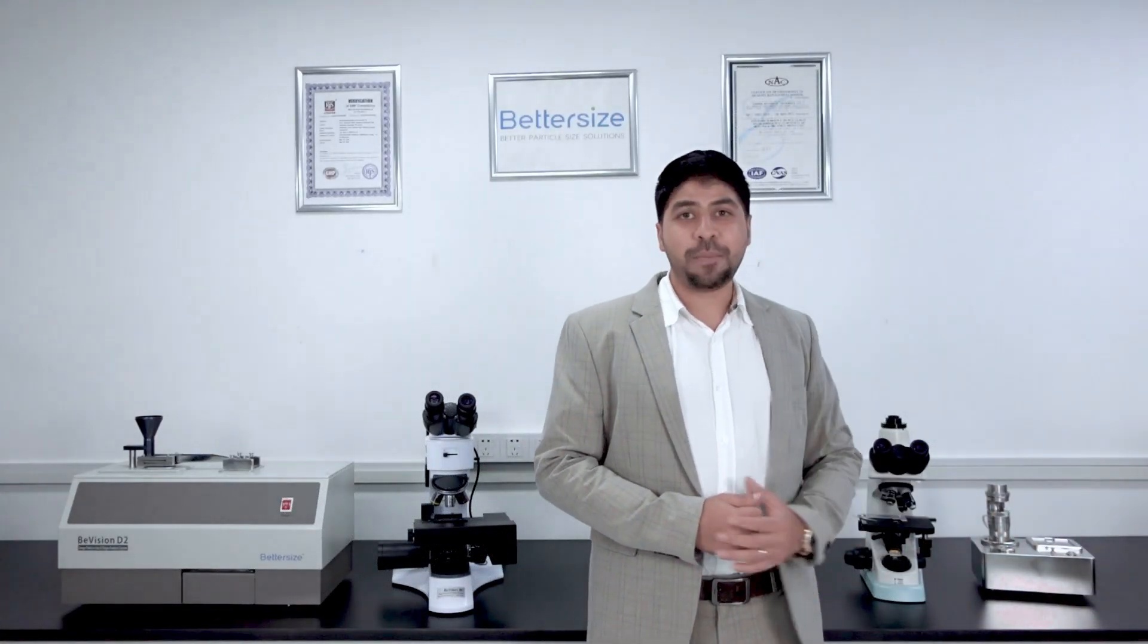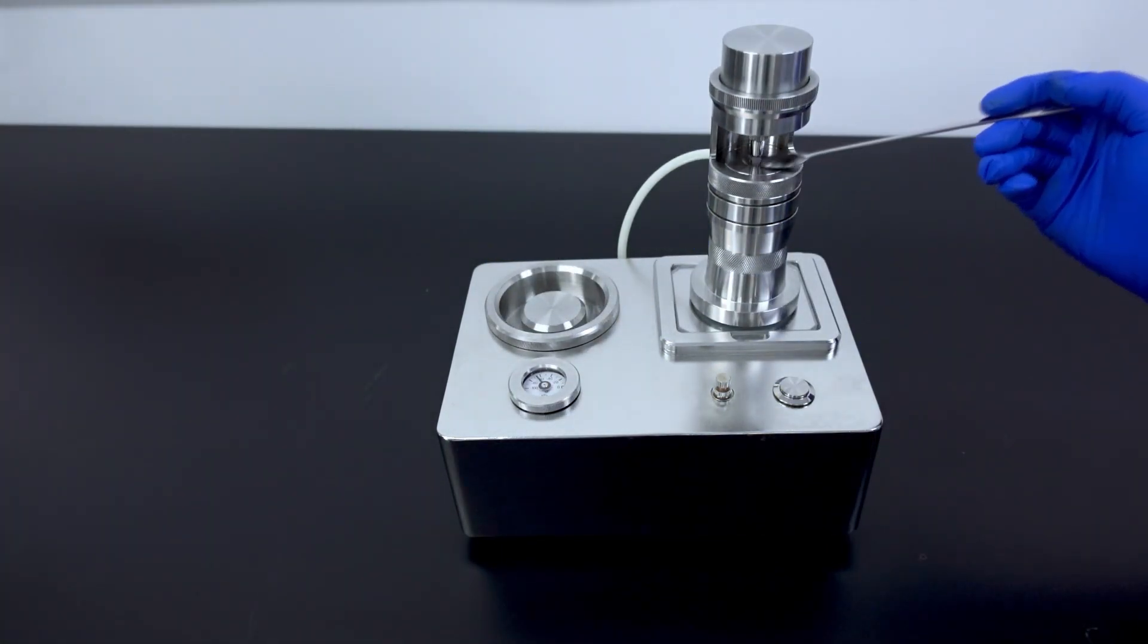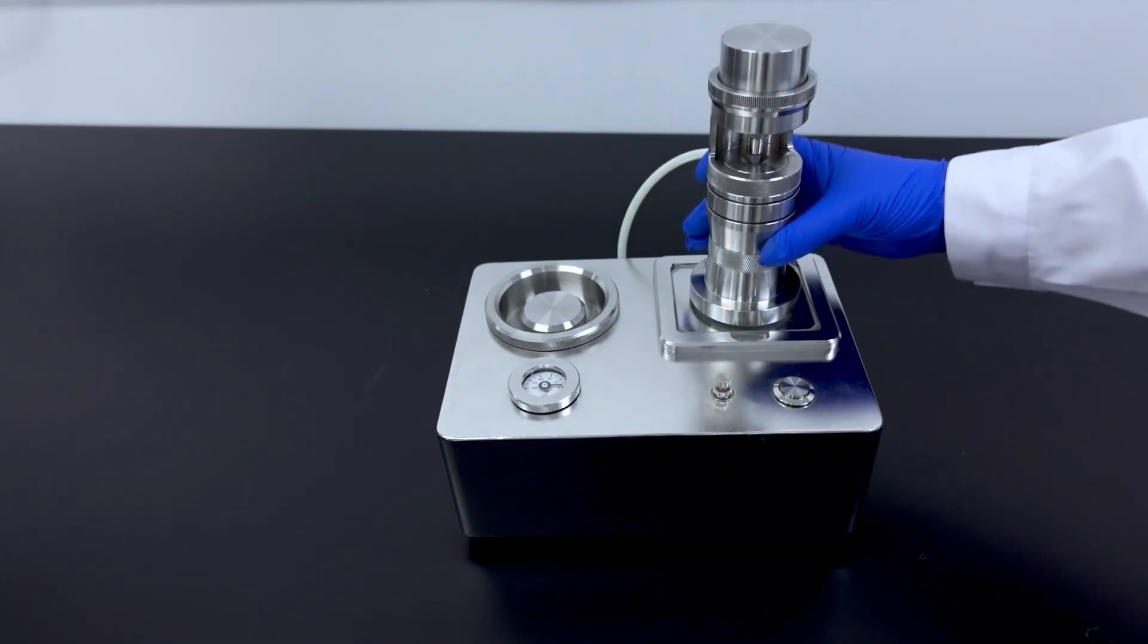An optional dry powder suspension module, VT910, can help you with dry powder sample preparation and develop a repeatable suspension method.